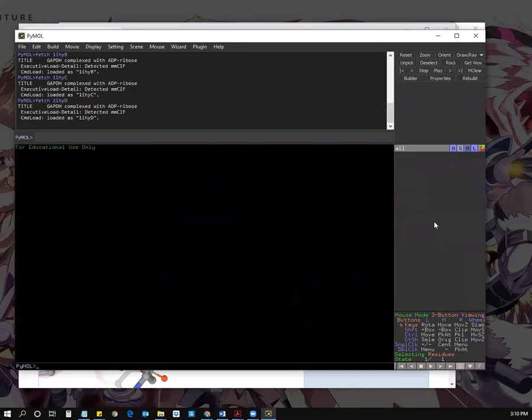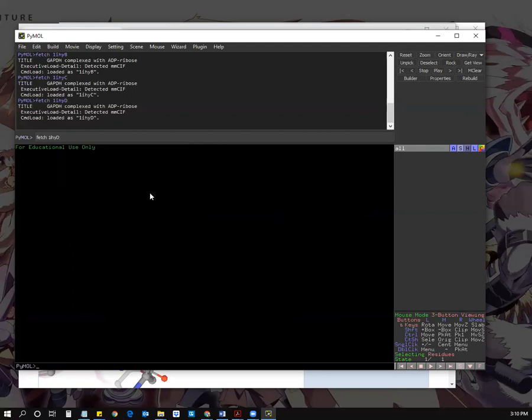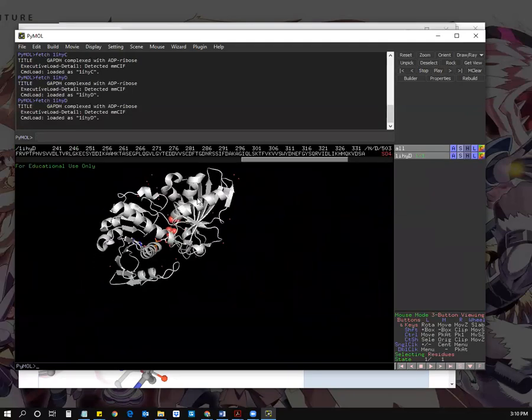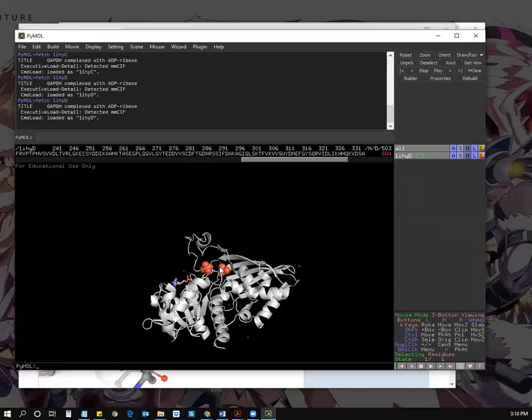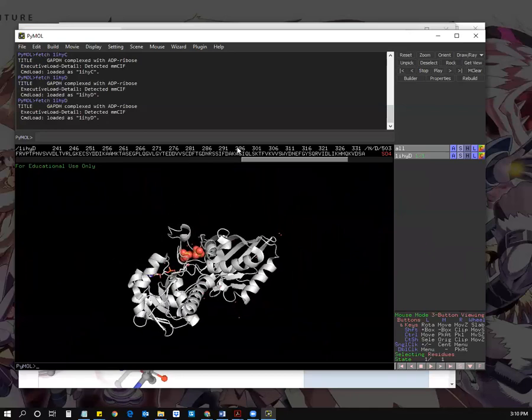Sorry, delete everything, not delete selection. I'll go back to the fetch command and make sure that I load chain D. So fetch space 1IHY, and then a capital D. Remember that the chain letters need to be capitalized. When I click that, now I have my protein and my ligand loaded up there.